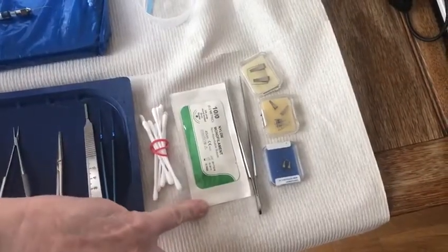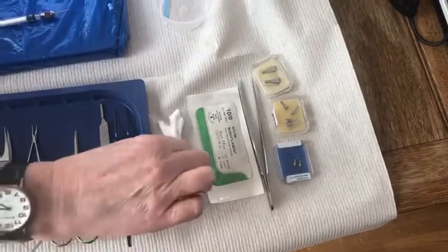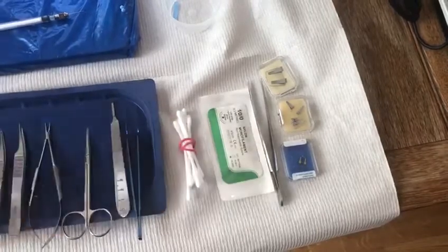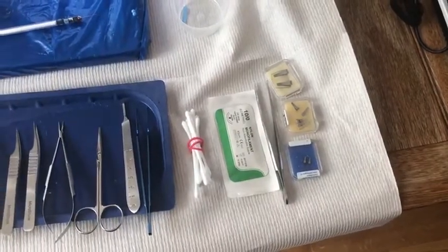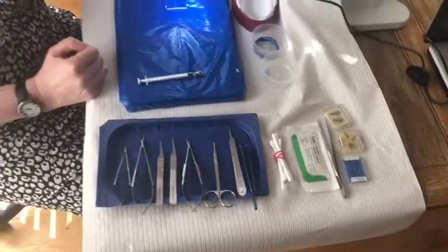Then you will need a suitable 10-0 suture, and also you may need some little swabs — just some Q-tips will do for when you're dissecting out your chicken. So that's really the basic setup and that's all you need to get you going. Thank you very much.